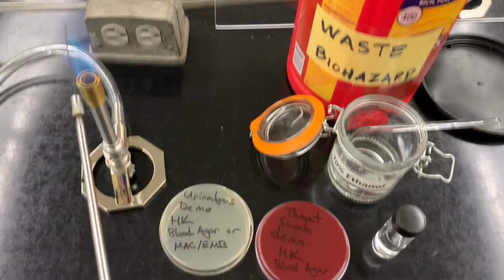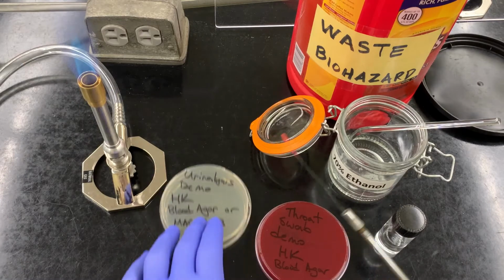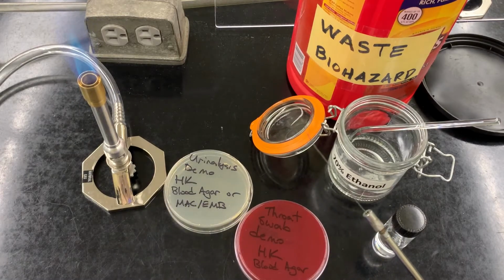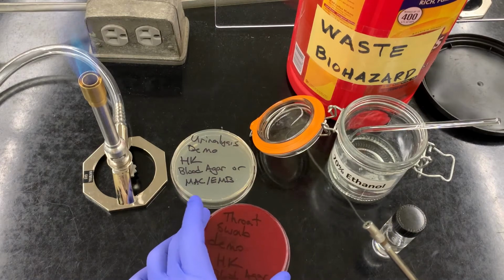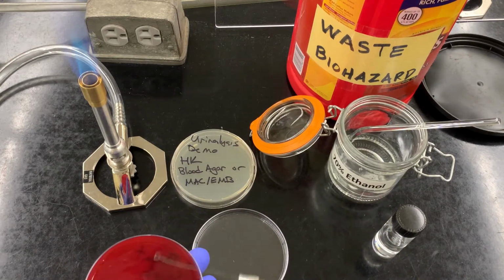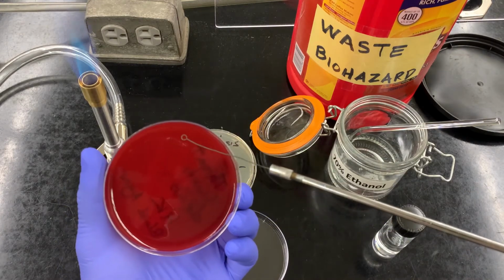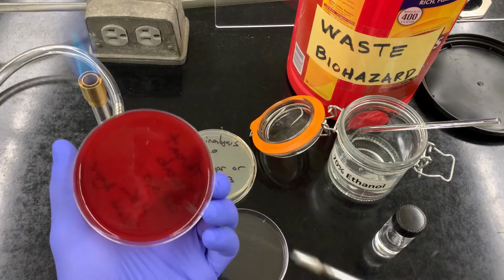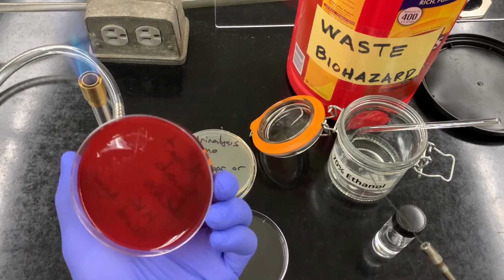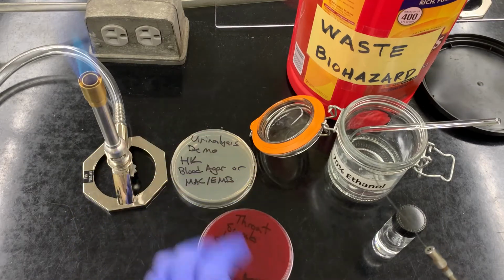And then I'm going to take my loop, nice and sterile. And then we're going to streak for isolation. And you can see the diagram in your book. We actually are going to cheap out and split this in half, right? So imagine this imaginary line down the middle. And all I'm going to do is go like this, and then just streak it out like that. We are not going to try to quantify. We're not going to try to do anything. Just see what types of microbes are living in the back of our throat.